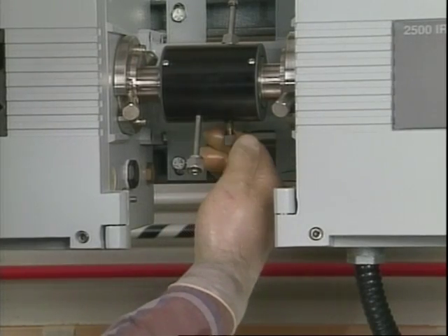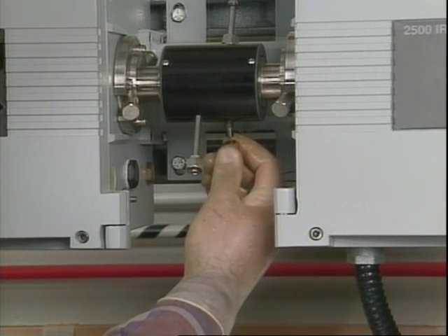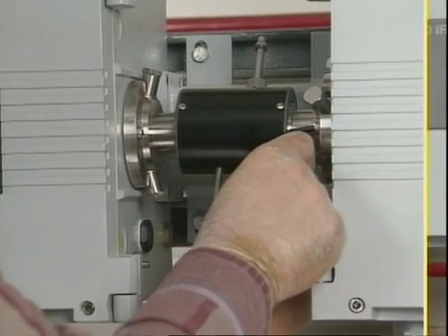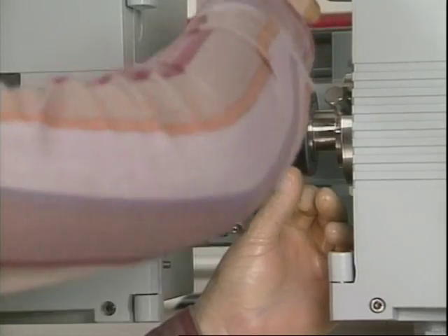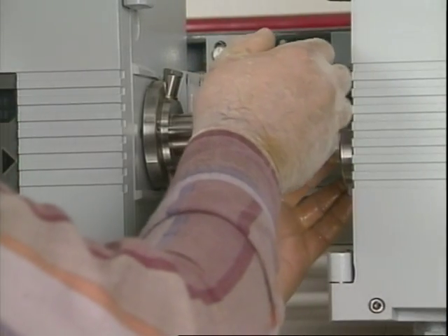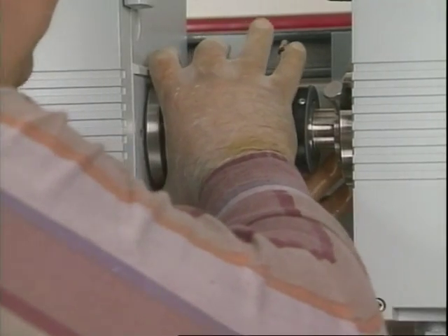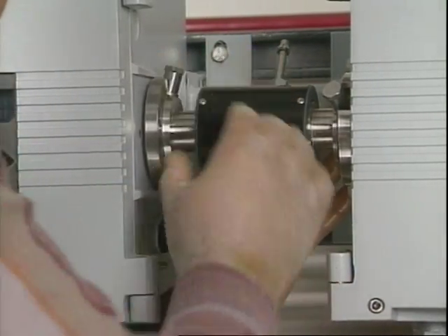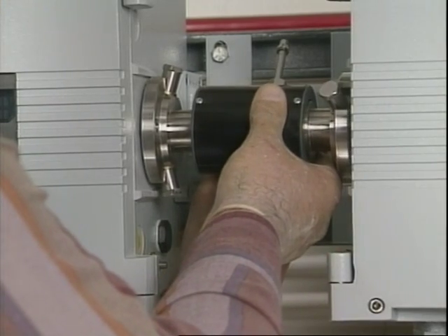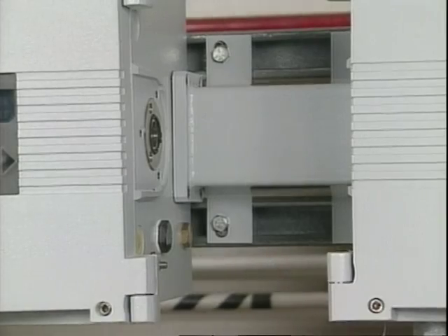If your analyzer is equipped with a thermocouple, carefully disconnect and remove it from the cell body. Loosen the screws holding the cell flanges at either end of the sample cell. While supporting the cell assembly, pull the flanges inward from the cell ends. It may also be necessary to loosen the screws holding the source end onto the mounting chassis. Now, remove the cell assembly.